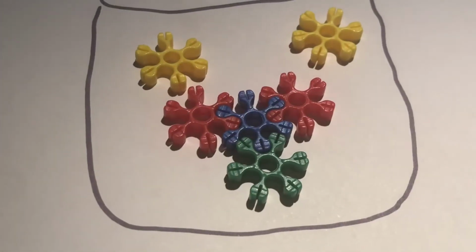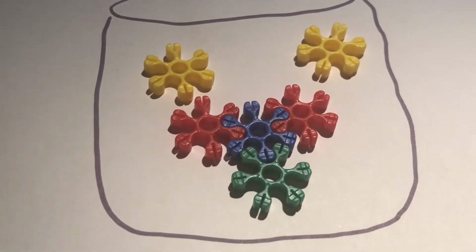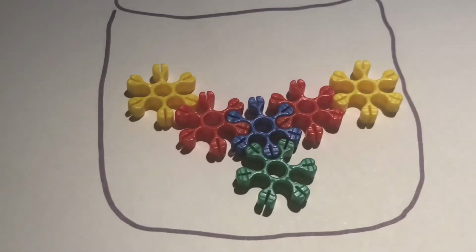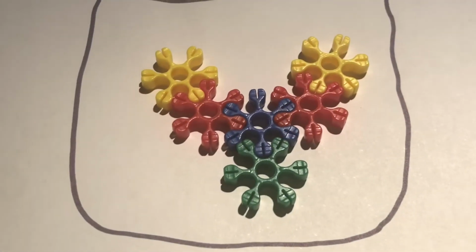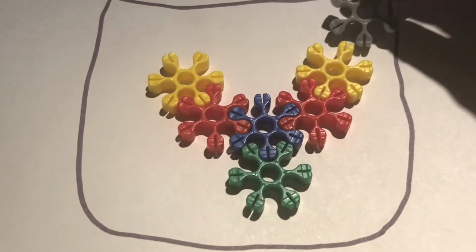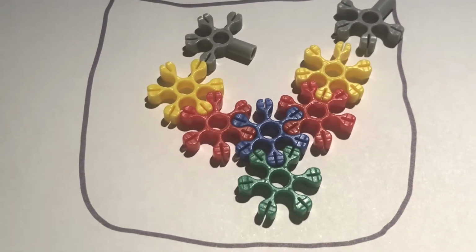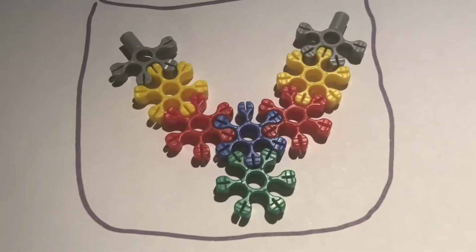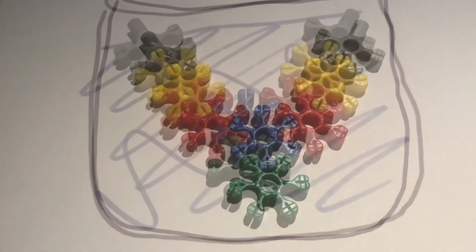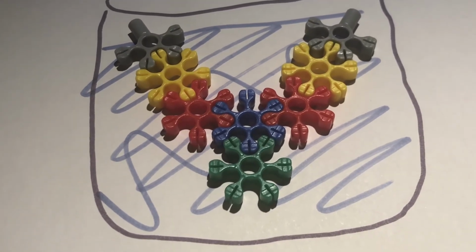After that, we will add in the horseradish peroxidase, an enzyme that will attach to our secondary antibodies. Of course, we can't have an enzyme without our substrate, so we are going to add in our TMB, also known as tetramethylbenzidine. After our enzyme and substrate bind, it will be indicated with a color change. The color change will indicate whether our patient has Neisseria meningitidis or not.